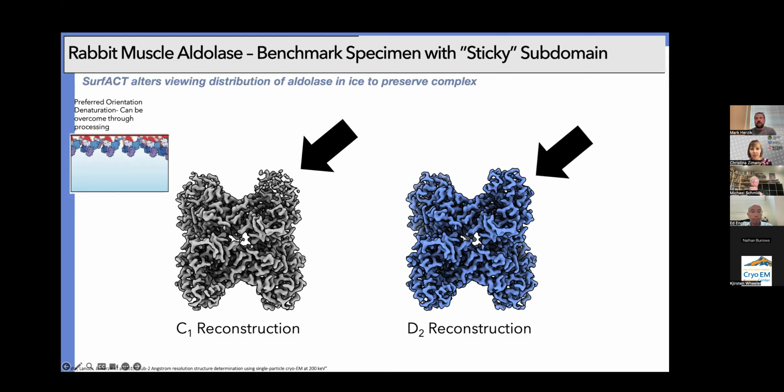Because of their different properties, the breakdown from that micellar population back into the free components can potentially be too slow. So you're not really having a nice homogeneous distribution of the free surfactant molecules that you need at the air-water interface, whereas you may have more of them still in the micellar population. We think that leads to a poorer outcome than keeping it low.